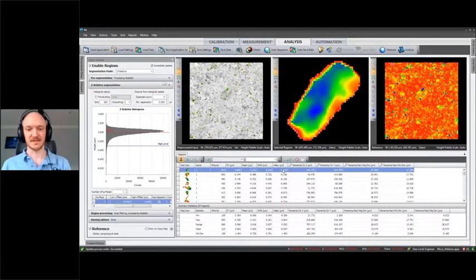Here we also see the valley. So this will be calculated from our reference surface. In this particular case, the lowest point is at -6.8 or 6.9 microns below the mean. And this is how we would build up an application to perform a defect analysis.